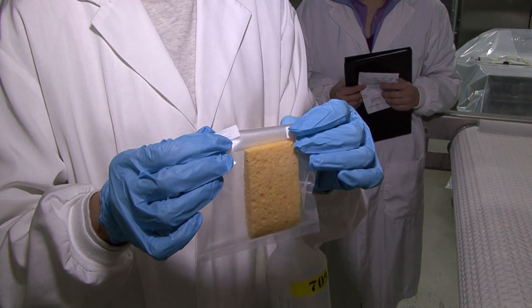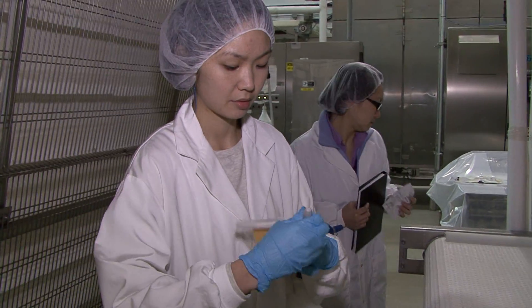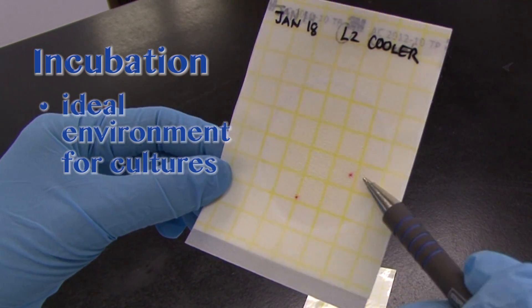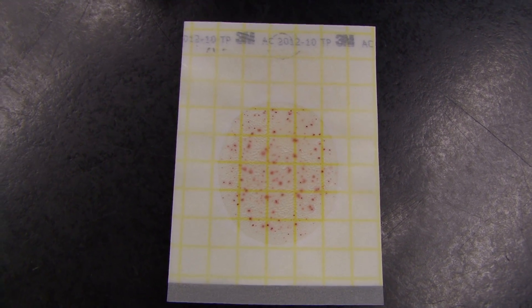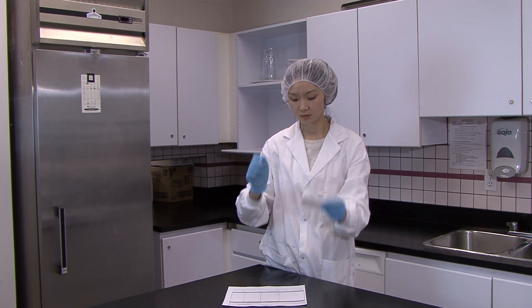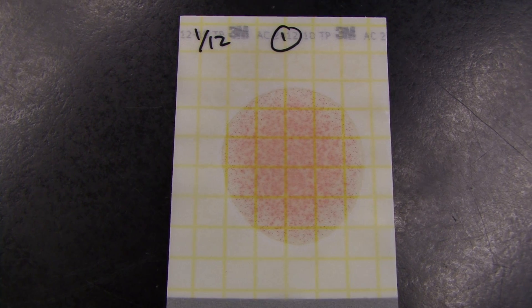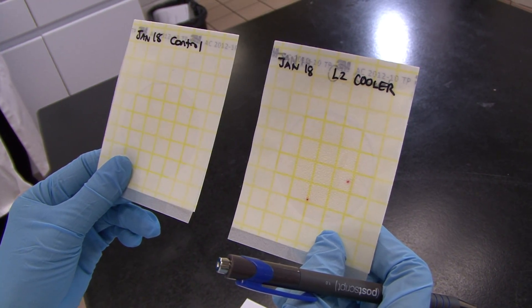One of the big advantages of sponges is that they get better surface contact than the swabs. Incubation allows the bacteria to grow into colonies that appear as small coloured dots on the film. Different types of bacteria may appear as different colours. These are counted to give an estimation of the contamination levels. If you find that bacterial counts are beyond the acceptable level — and what is acceptable varies depending on the food being processed — then you need to determine if your cleaning and sanitising procedures are adequate.